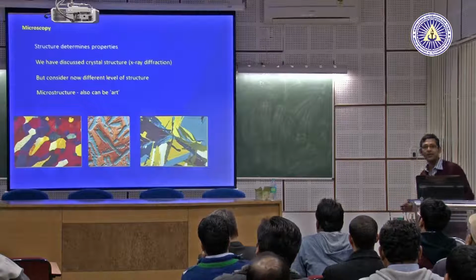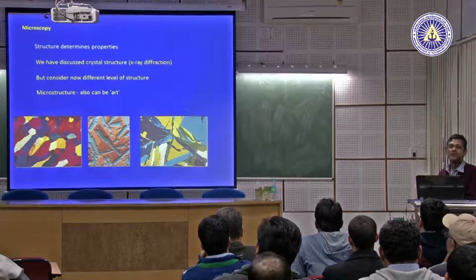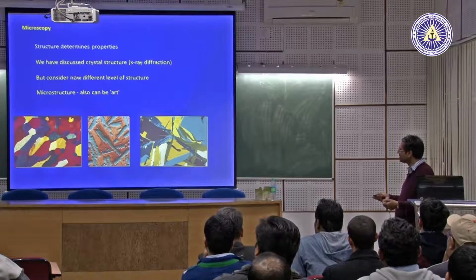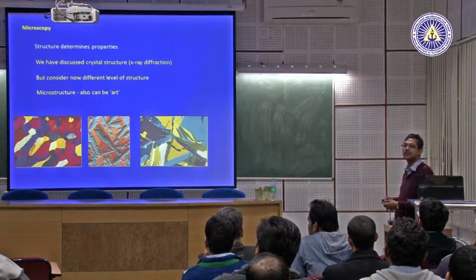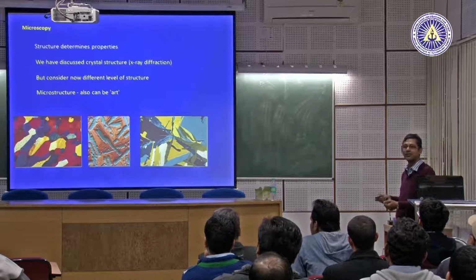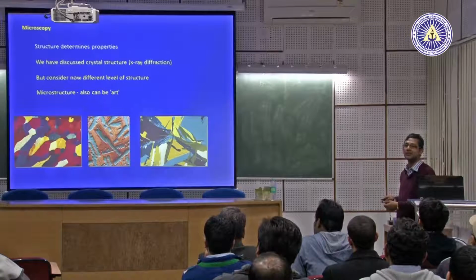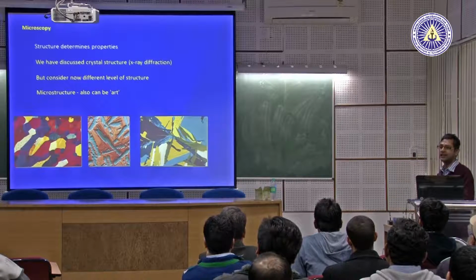So you can generate all kinds of microstructures. But why do you do that? To get information out of it. That's more important. The mistake we normally make in real life is that we can look at it, but we don't understand it. What is inside? What information does it carry? At the end of the course, you must have that idea, so that you go back to your colleges, obtain a microstructure like this, and be able to read it and get information out of it. That is where most people lack understanding.